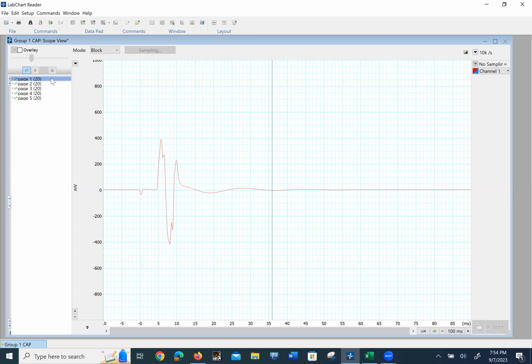So to make your measurements, you could do one thing here. And then I'll stop and record a different video on how to do the cut and paste and make a graph out of these. But you can take your M marker, for example, put it down on the baseline over here. Let's pick a few peaks. Hey, you gotta write this down. So you could choose this first peak, and you could say, okay, I'm going to look at the peak amplitude of this first event, and then go way over here to the right-hand side. You see where I'm circling over here? But I can't do this while I'm moving the marker. So you got the M here, move the marker up to the top.